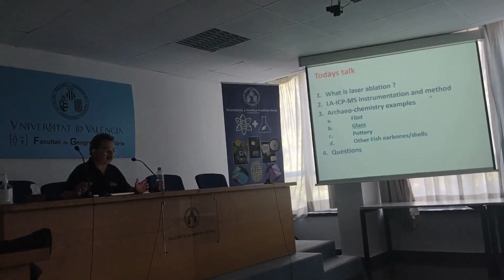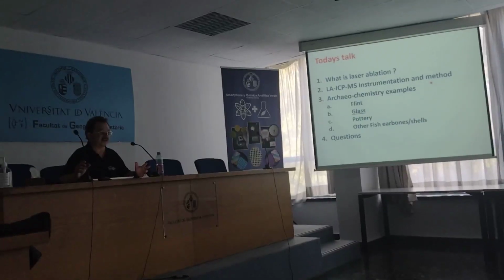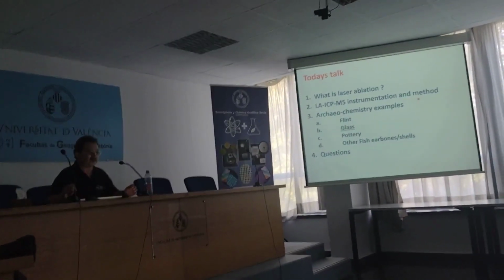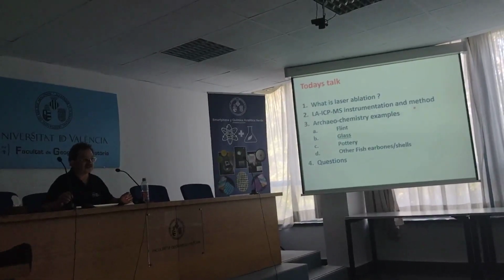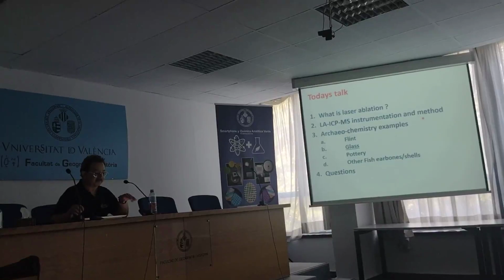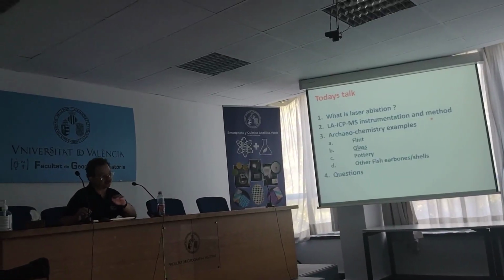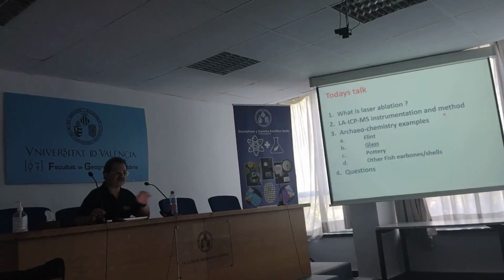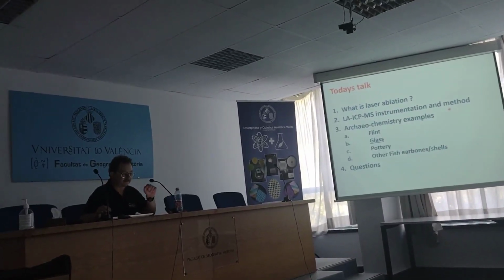So today's talk, I will start by what is laser ablation, and then a little bit about the instrumentation and the method. So if you are an analytical chemist, please stay awake at the beginning. But if you are an archaeologist, you may fall asleep for the first 10 minutes. If you are archaeochemist, then you must listen to everything.